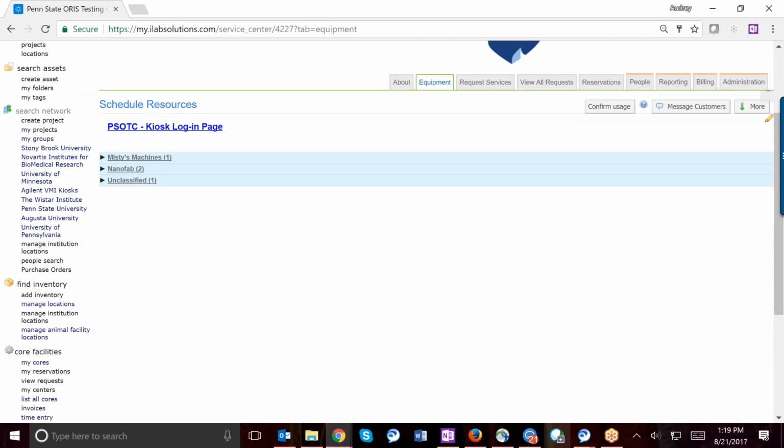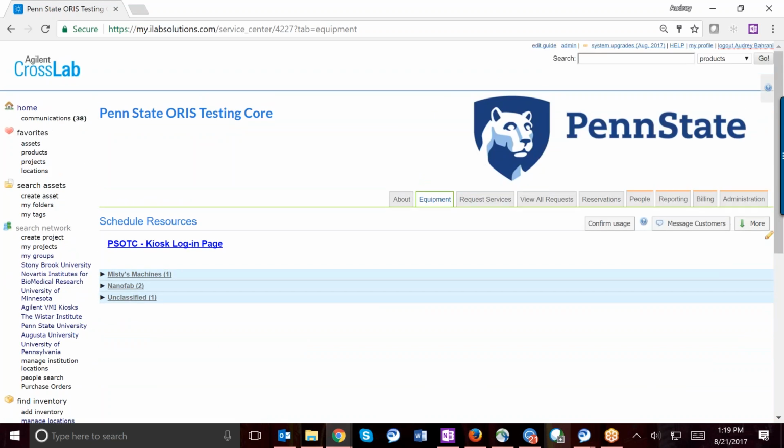I'm going to change gears a little bit here and kind of go through a brief billing tutorial. So in order for any of our events on our calendars to show up on our billing event, we do have to confirm them first. There is a confirm usage button on this tab. I'm going to go into that little confirm usage button.